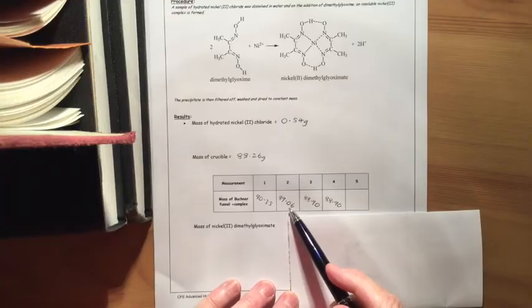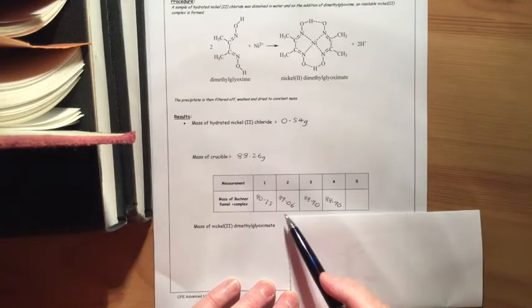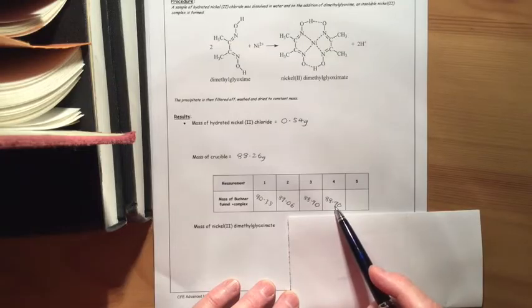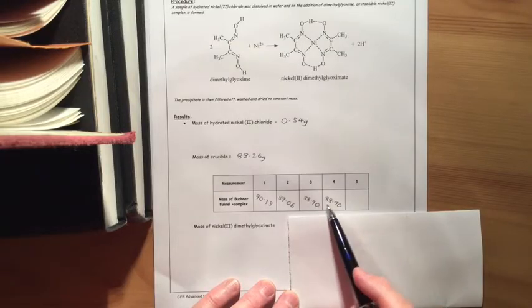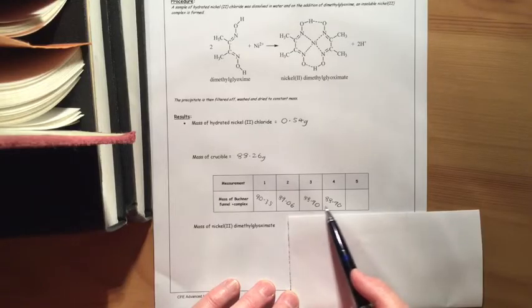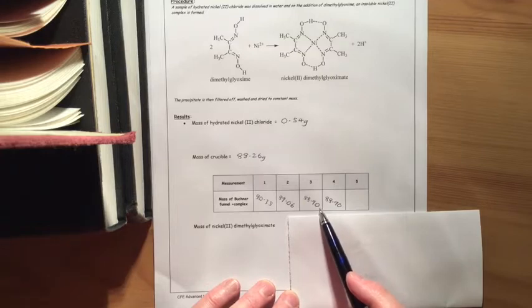My second weighing gave a mass of 89.06, my third 88.90, my fourth 88.90. So 3 and 4 are within 0.01 of each other, so that is defined as the sample being dried to constant mass.